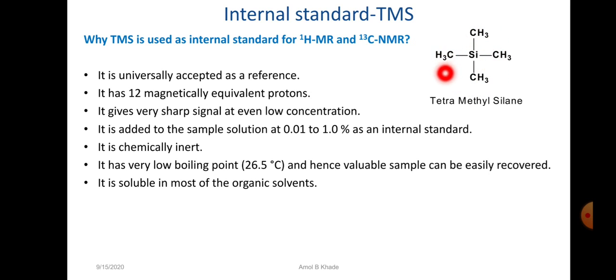We will discuss in further slides what magnetically equivalent protons are. All these 12 protons are not only in an identical chemical environment, but also in a magnetically identical environment. It gives a very sharp signal even at the lowest concentration.